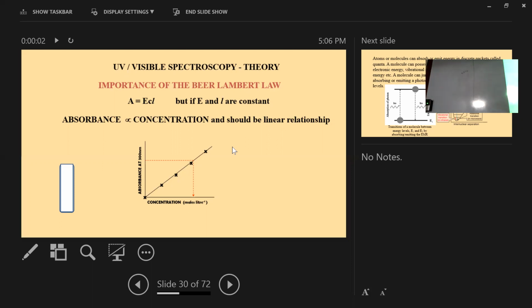Then if we have a certain amount of sample, a very small amount, let us consider 0.01 molar. In that case, the absorbance will be a little bit high. Let us consider just 0.1. Approximately, I do not know what would be the sample, but I can guess like this. This is the x-axis, and then along the y-axis that can be. Similarly, as we increase the concentration of the sample, that will increase the absorbance.